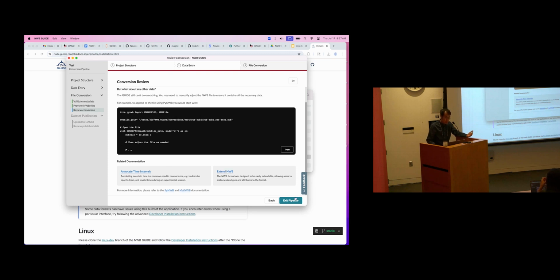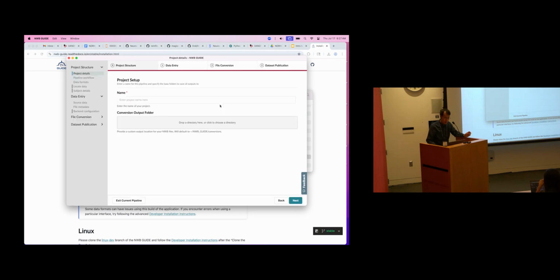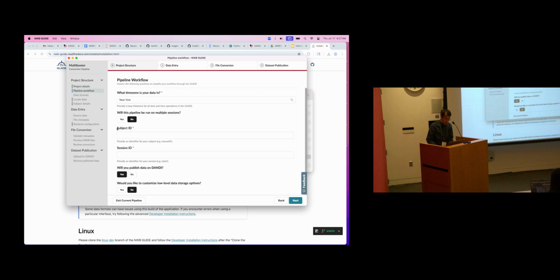Okay, so this was a single session, and then I'll briefly show you what we do to do batch conversions. You wouldn't want to do this process for all 100 sessions of your experiments. So I'll show you how we do that very briefly.